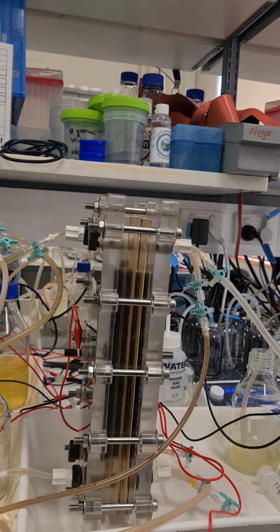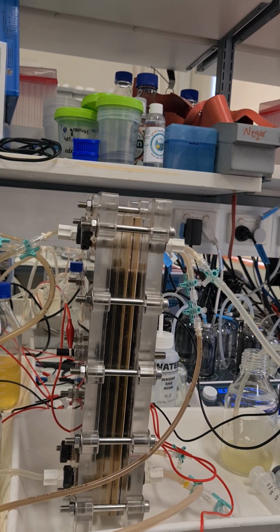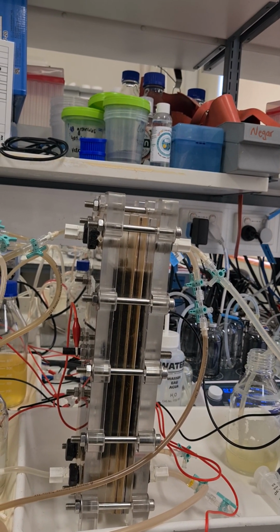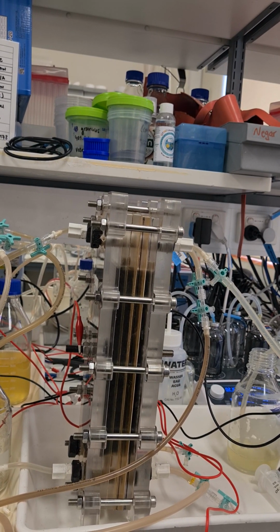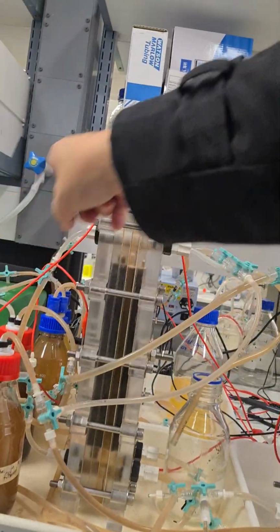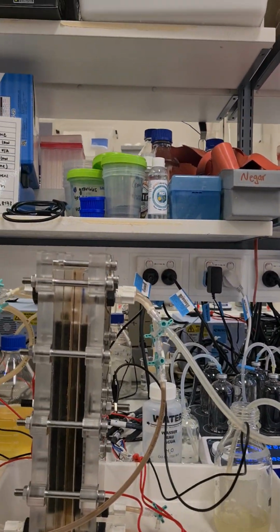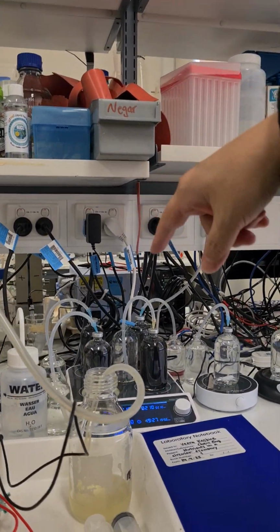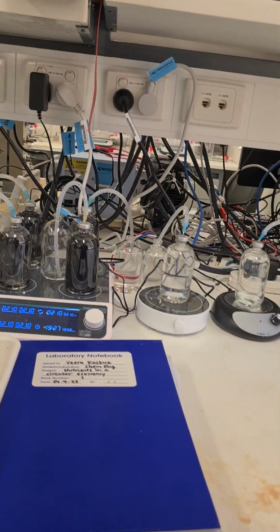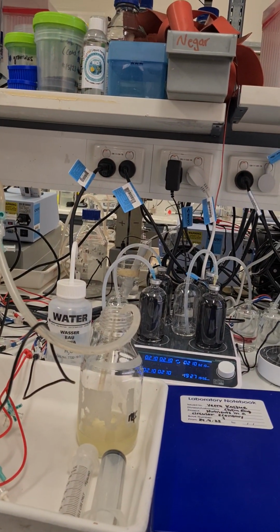Stefano loves it. So where do you measure your current density? Your electrical energy, how do you measure that? Yes, it's done by the potentiostat. Okay, so it's connected here. Yes, those thick cables come from the potentiostat. So this is now a 3 electrode setup: the anode, cathode, and then there's a reference electrode.